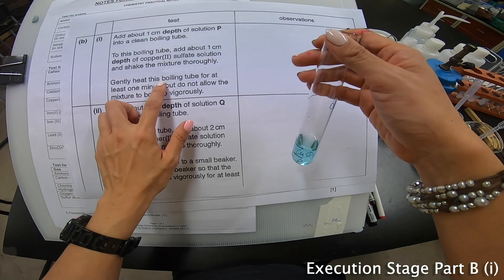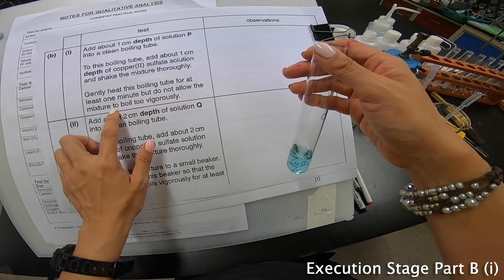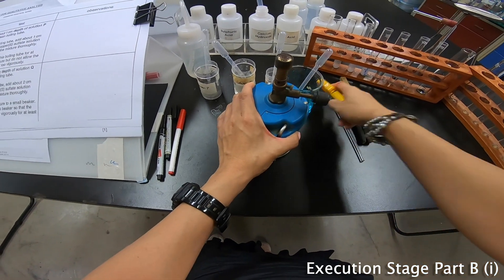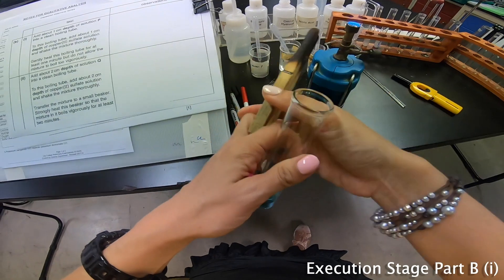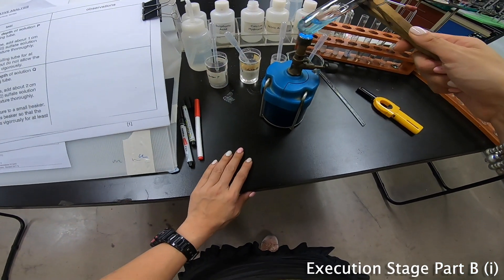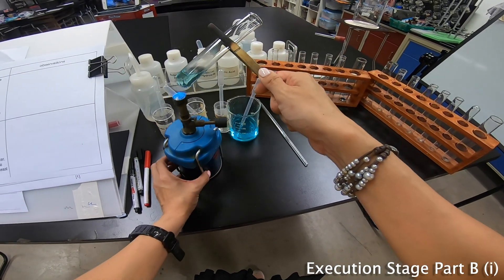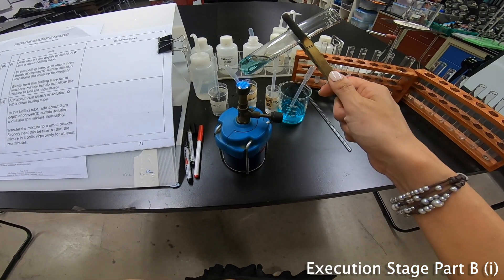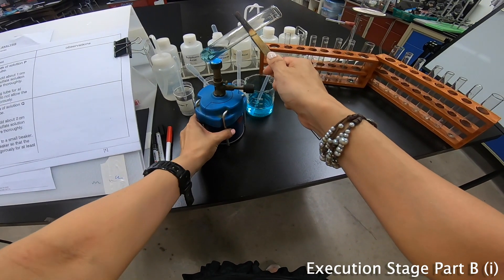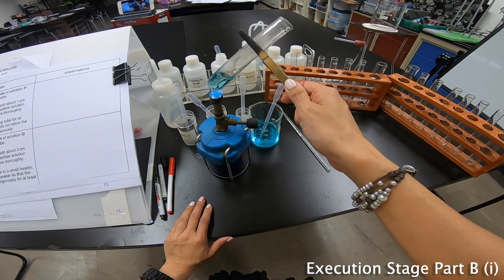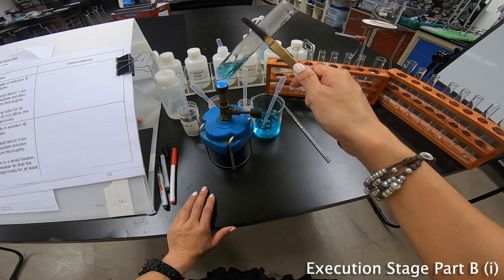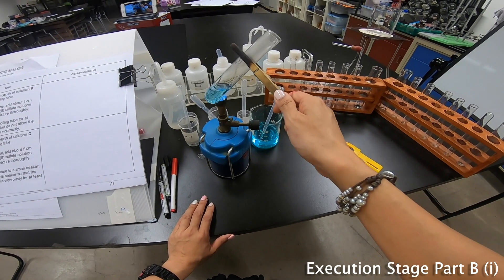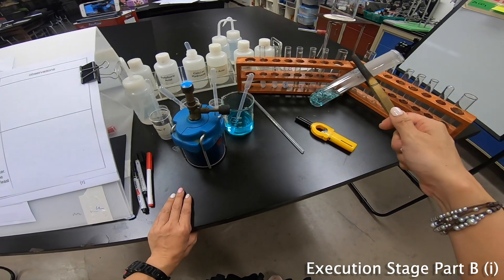Then they say to gently heat this boiling tube for at least 1 minute but do not allow the mixture to boil. So let me turn on the Bunsen burner. Let's put this down here first, set up the Bunsen burner. Heat this for at least about a minute, but do not allow it to boil too vigorously. So let me heat this first. Allow it to boil but not too vigorously, not too vigorously. Let's put it away.